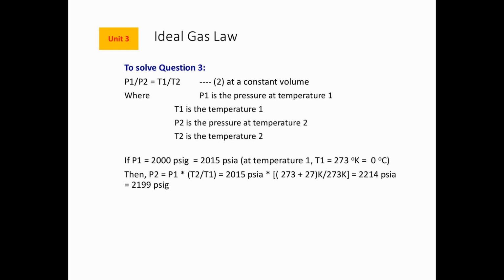For example, when you make hydrocarbon mixtures, due to condensation issues sometimes you calculate at lower pressure. Sometimes you have 10, 20 components containing the heavier components, and the pressure could be only 20 psig. That is really 35 psia, because you add 15 to it. 35 versus 20 is a significant difference. That's why we converted here to 2015 PSIA to give you the correct calculation.